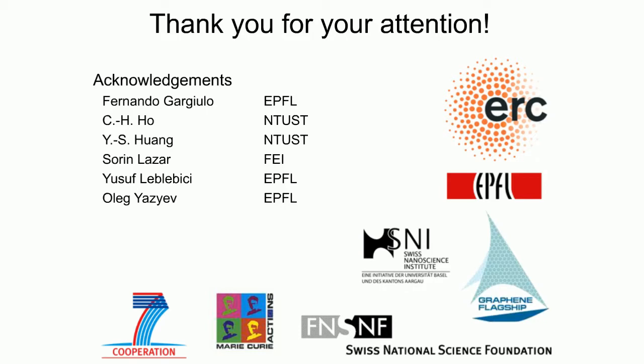And then finally, there's something we've done recently at Asylum, and that is we'll put these materials in fluid. Obviously, you have to use a compatible fluid, and we use that fluid to screen the surface charge that normally messes up your small amplitude tapping. We use like a 2 angstrom tapping amplitude, and we're actually able to see atomic defects. So that technique shows promise.